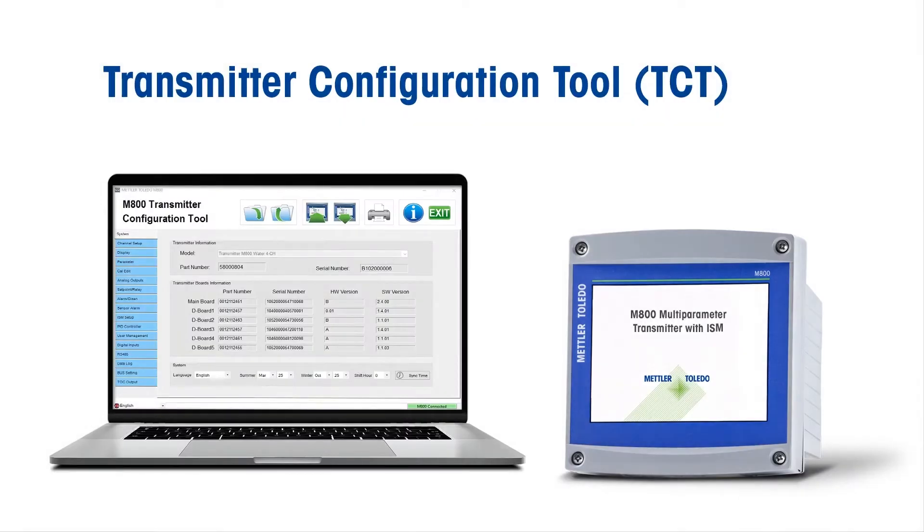The Mettler Toledo Transmitter Configuration Tool achieves intuitive, easy, and fast configuration of transmitters for process analytical sensors.